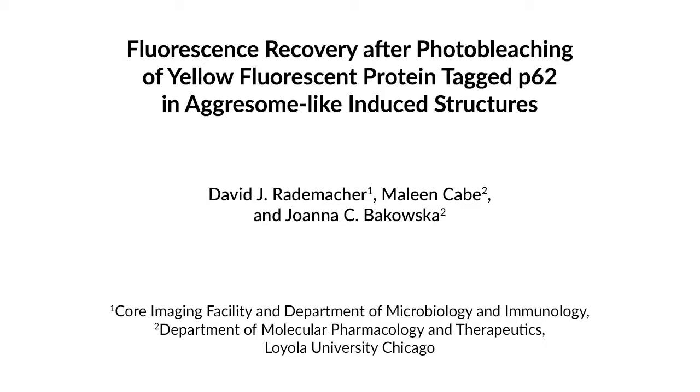Existing fluorescence recovery after photobleaching, FRAP protocols, are either incomplete or overly complex. The protocol presented in this video is significant in that it is comprehensive, practical, and straightforward. The main advantage of this FRAP technique is that it allows for the quantification of protein mobility within and between subcellular compartments in live cells.